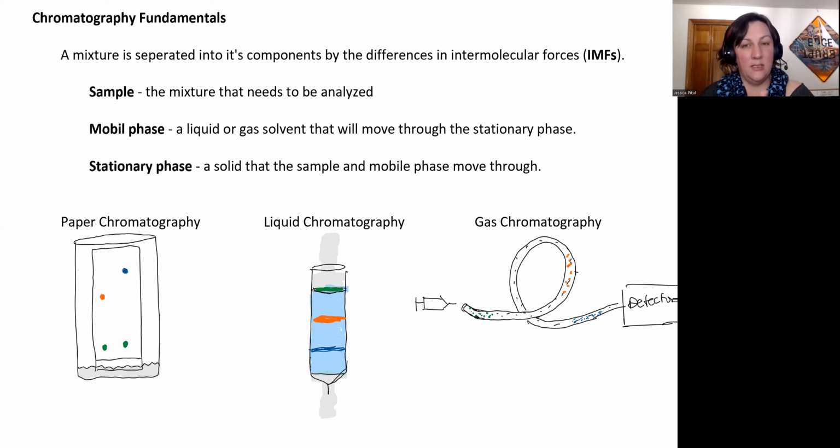which means we're really separating things based on how they dissolve in other compounds and how they interact with other compounds without bonding or without breaking bonds or without breaking the molecule apart. So the sample will be whatever it is that needs to be analyzed. It's the mixture.